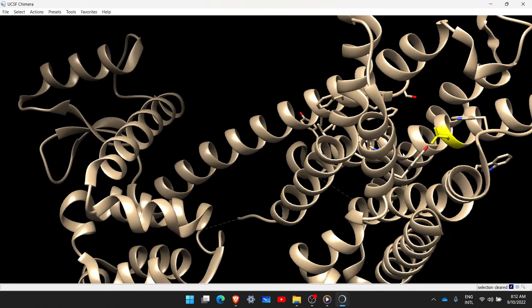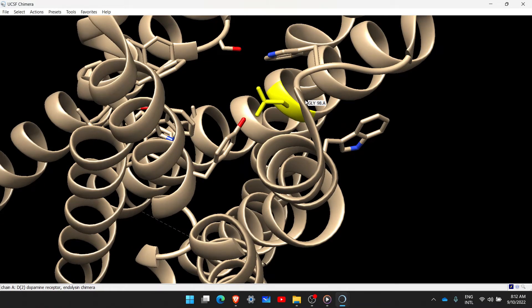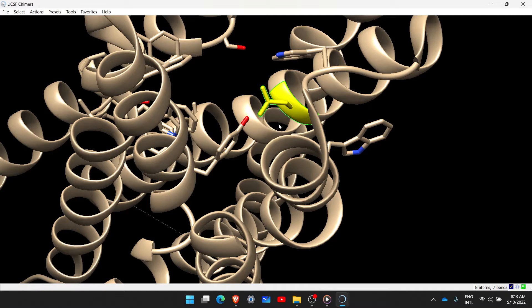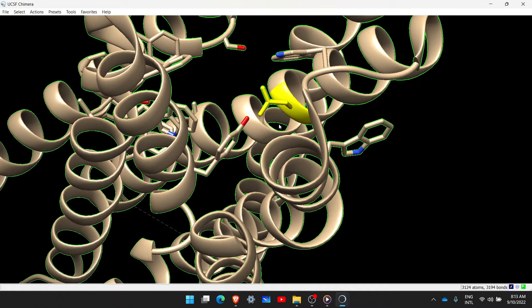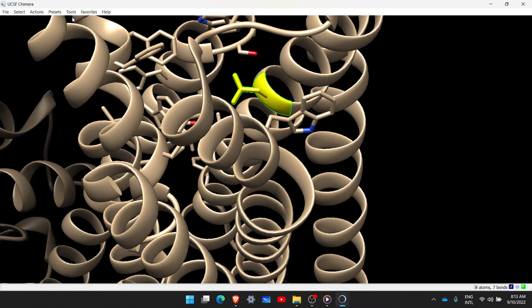Before we proceed, there is another way to select a particular amino acid in Chimera using the mouse and the Control button. Hold the Control button and left-click on any part of the amino acid you want. Once selected, keep Control held and press the Up arrow once — it will select the entire amino acid. Press Up arrow again and it selects the entire alpha helix; once more and it selects the entire protein. For our purpose, we just select the single amino acid we want to replace.